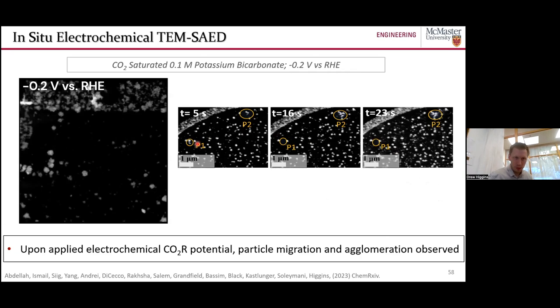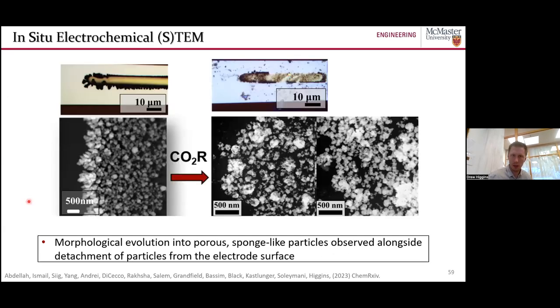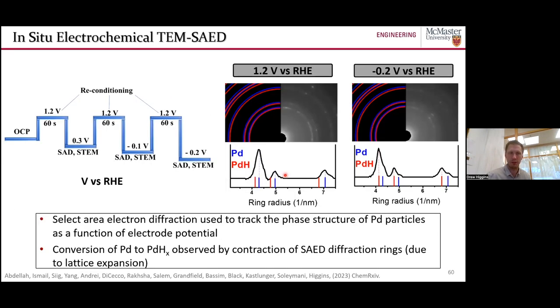So we started to run these measurements, applying electrochemical CO2 conversion conditions. We saw particles growing, particles moving around, a lot of things happening that I'll summarize a little bit at the end here. What I show here is an image of the electrode as prepared. So we deposit our electrodes and then we recorded a bunch of videos during the CO2 conversion process. We probably don't want to sit here all day and watch videos, but this kind of summarizes the starting point and the end point. And we were able to capture data all the way along during this structural transformation that we observed.